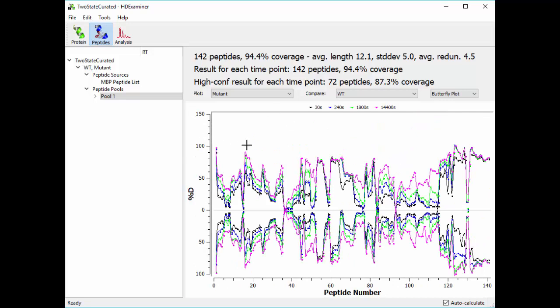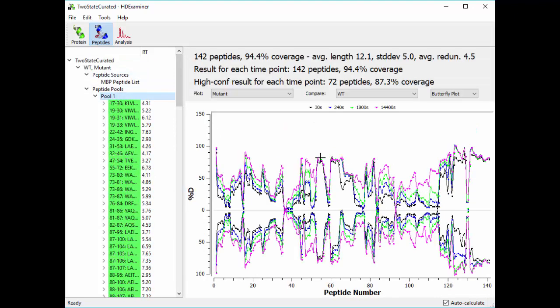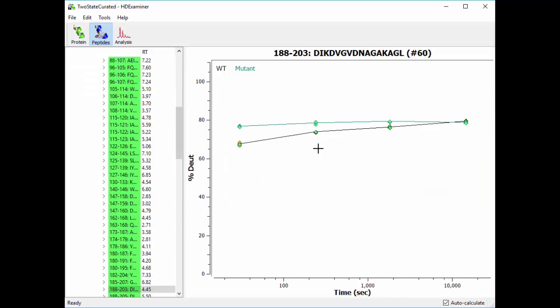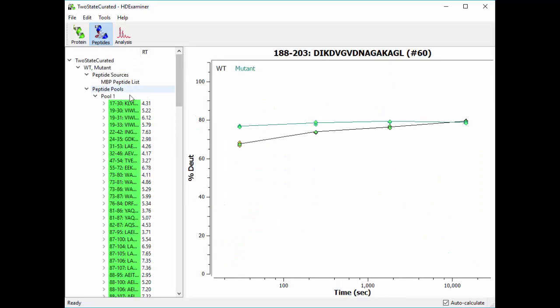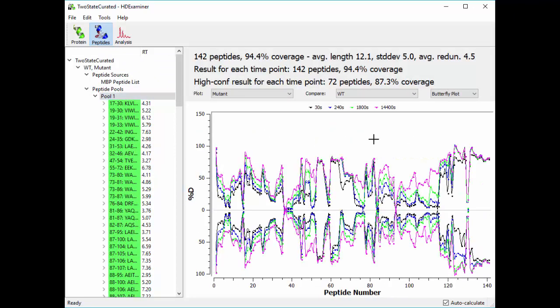Some of these plots have a behavior that if you click on something, like in this case, you click on that point and it brings you to that peptide. That behavior all still works even if you're zoomed. So if you click on this point, it takes you to that peptide. If you zoom in and you click not on a point, it unzooms.